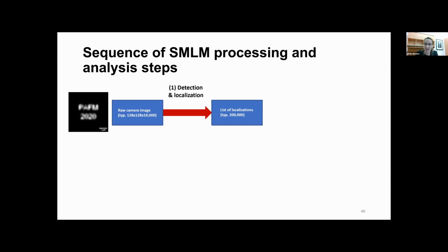But you're right. If it's a single emitter, you calculate it, you simulate it, and you know exactly what the response of your system would look like, and it should have a certain size. But sometimes it doesn't. It allows you to get rid of localizations which you don't want to have. But as I said, I'll get to this in two more slides. Just wait a bit. Okay, awesome. Thank you.